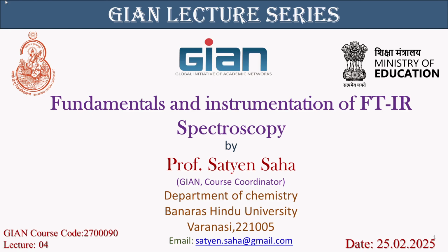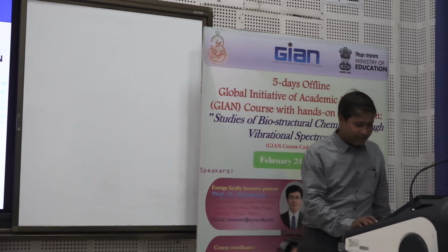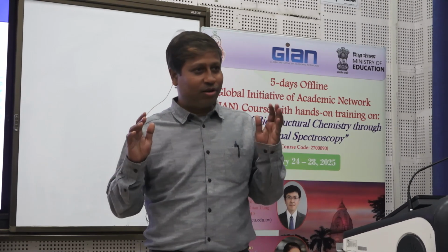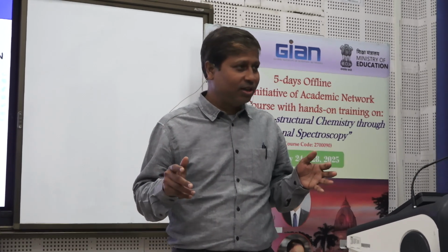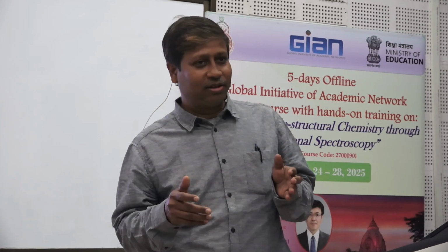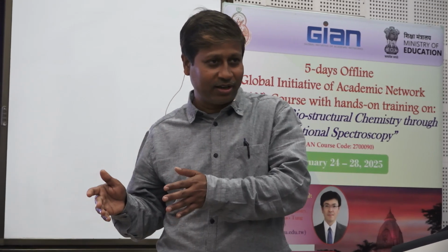So, this is the second lecture, and today I will be speaking on this topic, and this is much easier than what you have heard of. My main purpose will be to give a feeling for the spectroscopy and how the theory develops and how the theory is developed to match with the experimental data.